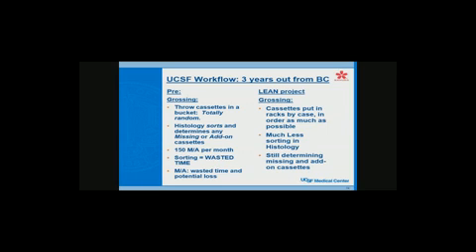But I wanted to go through one example of a workflow modification. This has to do with grossing, handling cassettes. Several years ago, the process for grossing was to print a cassette on a standalone printer, one of those Raymond Lamb printers. So they would enter it in CoPath, but then they would turn around to the printer and enter it again, and then produce the printed cassettes out of that printer. But then when they put the tissue in the cassette, they would just throw the cassette in a bucket. We're talking about a big gallon or 2-gallon bucket, 4 of them sitting at the bench there. So the cassettes in that bucket were totally random.